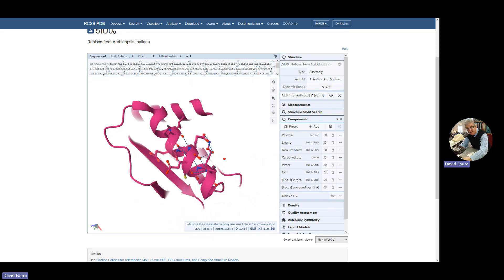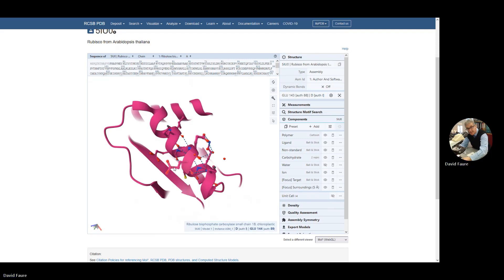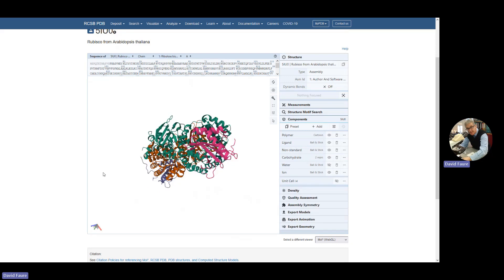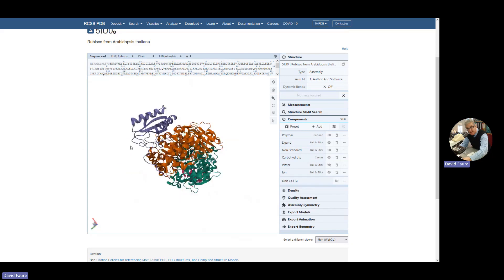This is the backbone. The ribbon represents the backbone of the amino acid chain, the polypeptides. And each of these structures here is the side chain. You can see those sticking out the side. So you click back on the background, it takes you back to the original view.